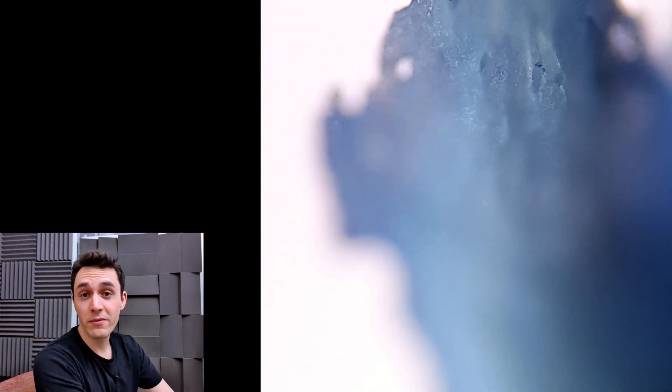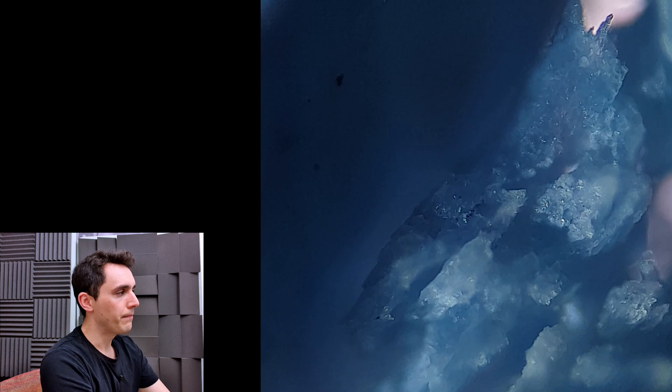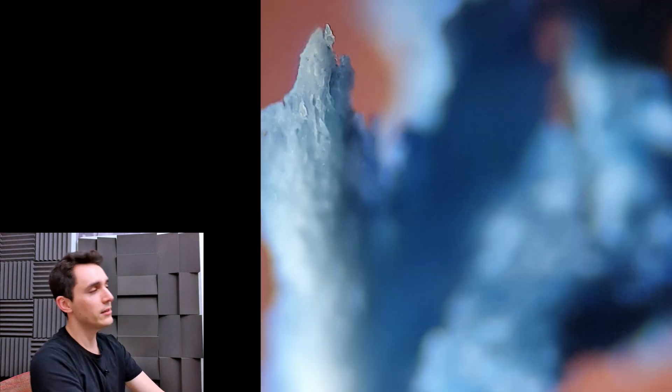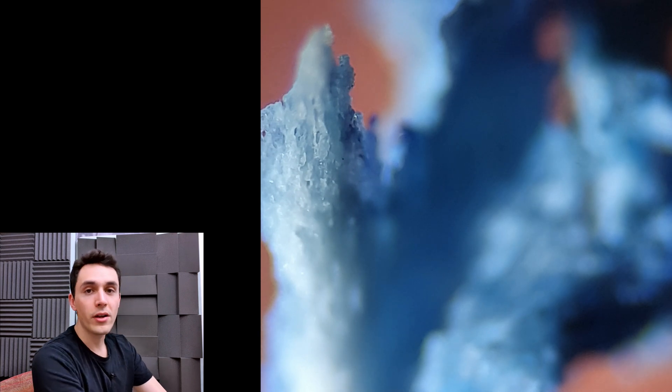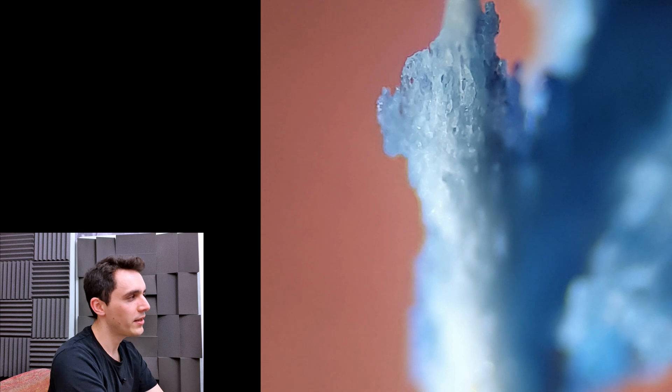I decided to stain it blue — not for any particular scientific reason, I just thought it would look nice and increase the contrast. I think what I've used here is Giemsa stain, not that it needed Giemsa stain specifically — I could have stained it with fountain pen ink. But I often find that when you stain things, you increase the contrast and it's nicer or easier to look at at very high magnification. I think this is times a hundred, maybe something like that.